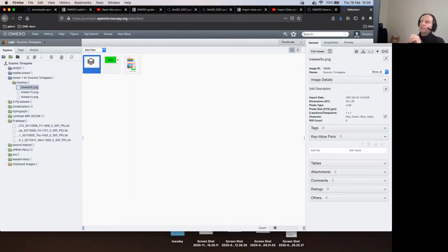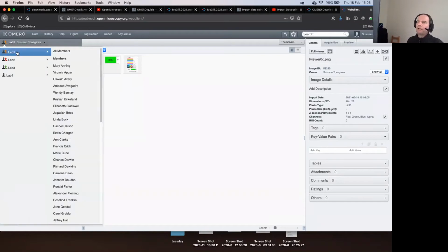The way to go about such workflow, and this could be actually a good sequel to the next part, is to use the provisions of our clients, which are called all members here. Right. Okay, so OMERO insists on ownership, on a single unique ownership, meaning one object has one single owner.